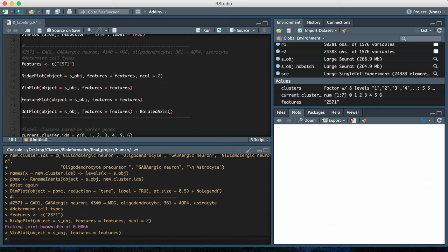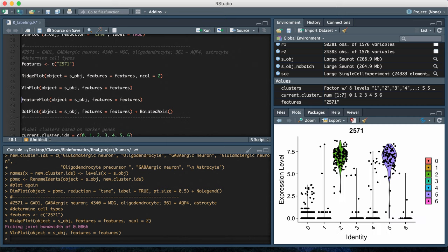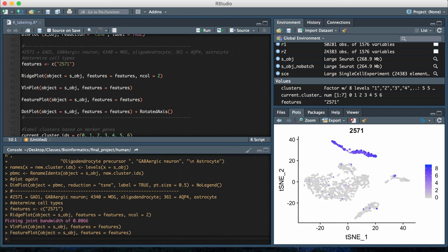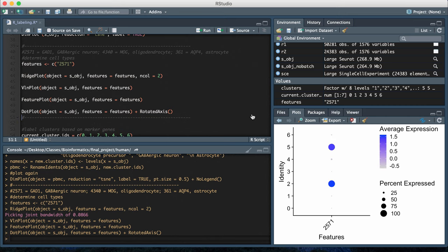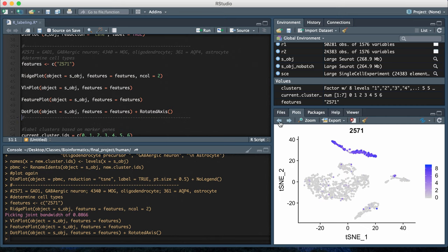Hopefully these four different plots will give you the same answer about where these different neuronal markers are being expressed. I'm just going to run those four plots and then go through them.